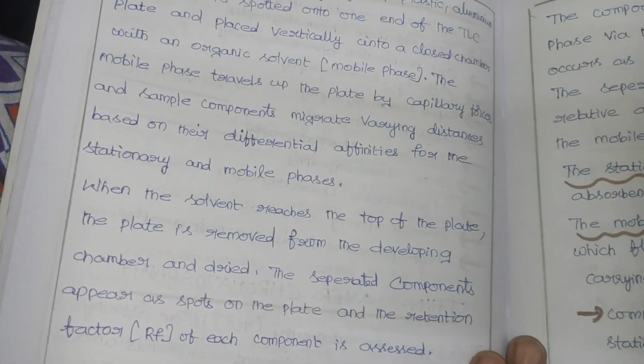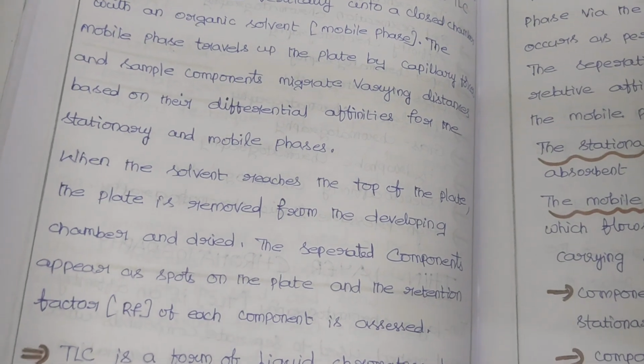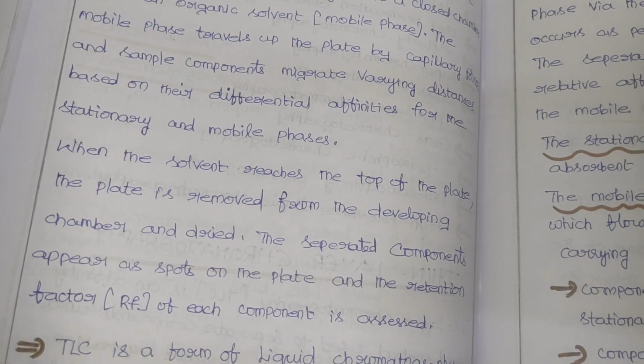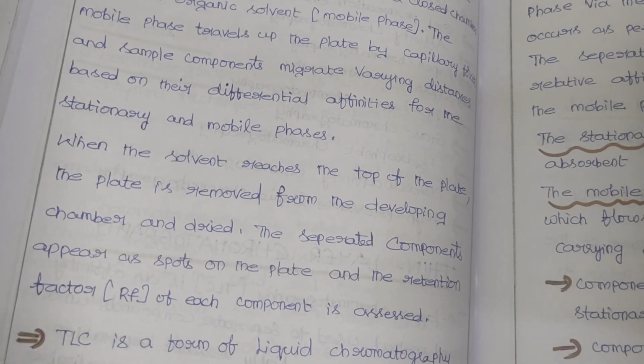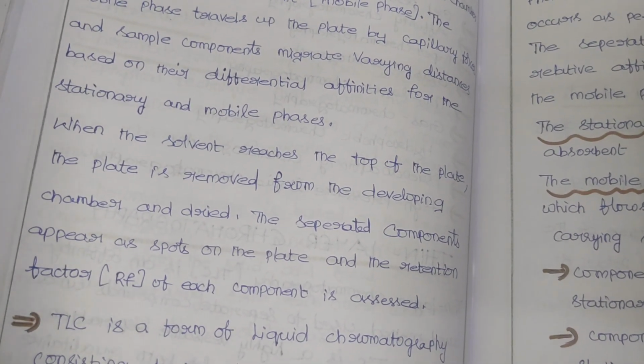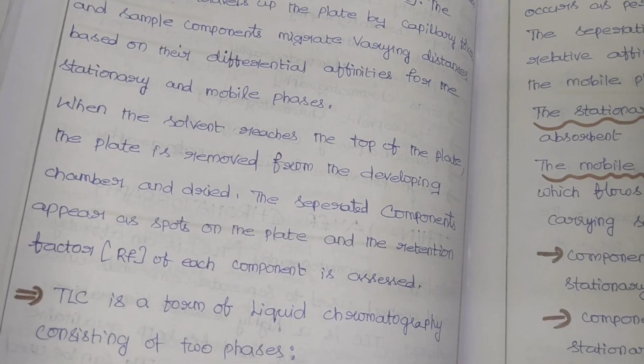Then when the solvent reaches the top, the plate is removed from the developing chamber. So when it reaches the top, we have to remove the TLC plate and dry it. The separated components appear as spots on the plate, and we can calculate the Rf, as I already told.